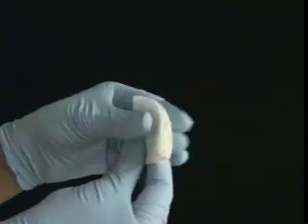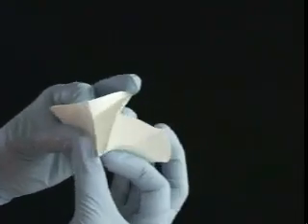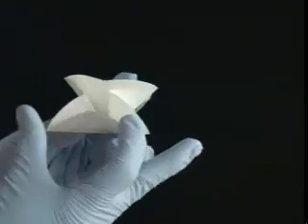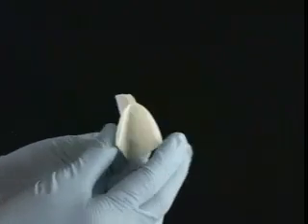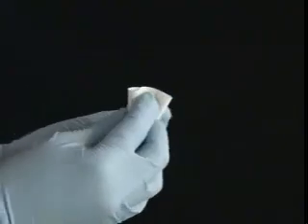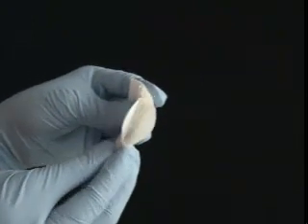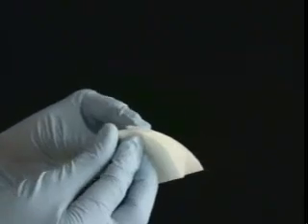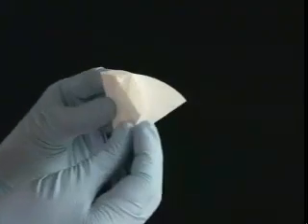Notice how it now forms a sort of X. Open it slightly and do the pinch-and-push move once again, this time in the opposite direction. You should have four main sections. Take one section and separate it from the rest. Push in the crease and fold back the little triangles that form. Do the same thing for the next three sections — essentially you're forming two little triangles from one big one. You're halfway to a fully fluted filter paper.